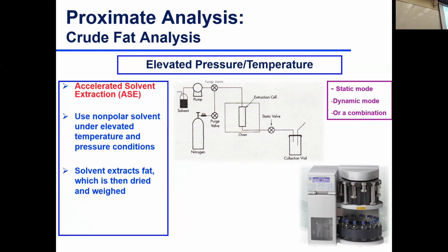But if you have it in dynamic mode, that's a lot of use of solvent. You can actually have it in static and dynamic at the same time. You can have semi-continuous extraction. So you can have it a little bit closed with the soaking effect, you open it, allow the solvent to go through, and then maybe another cycle of solvent, close, soak, and then open it again. So you can play around with the setup, either have completely continuous extraction, a batch extraction, or a semi-continuous extraction.